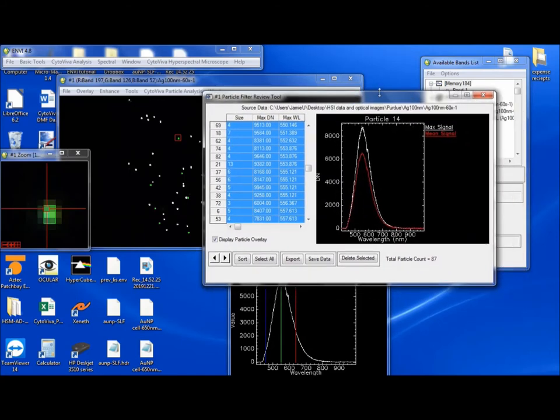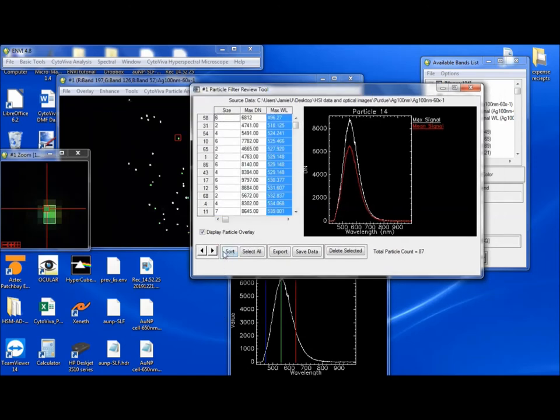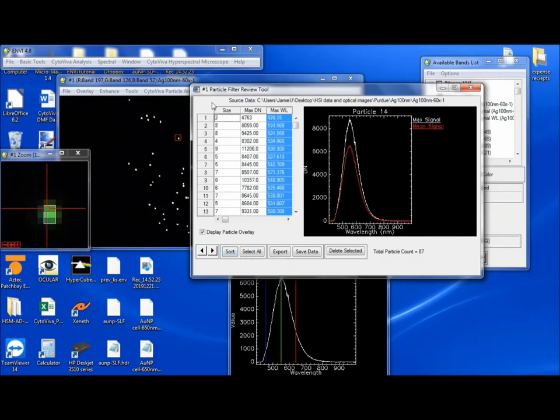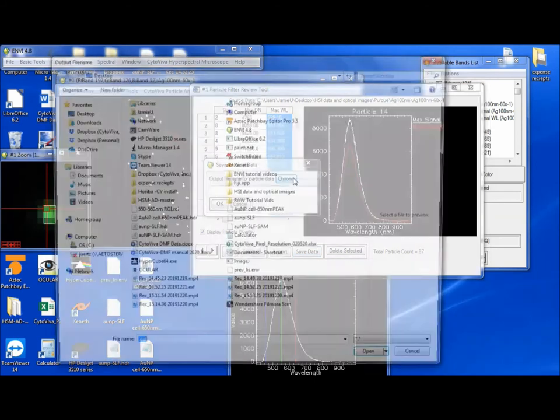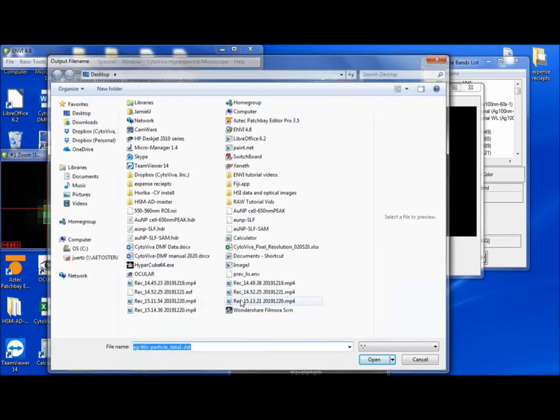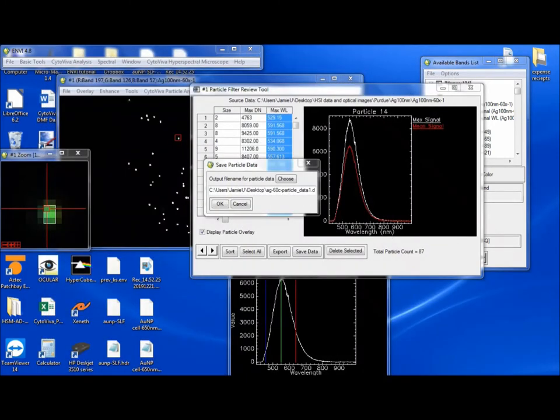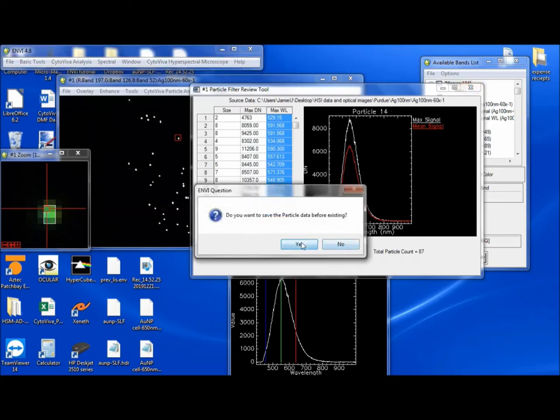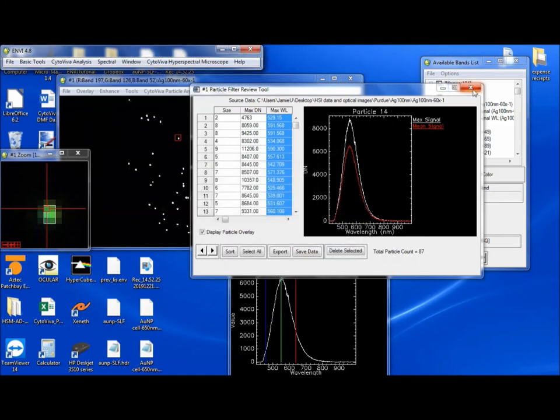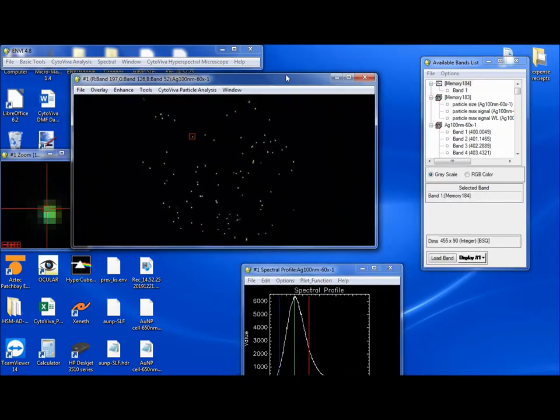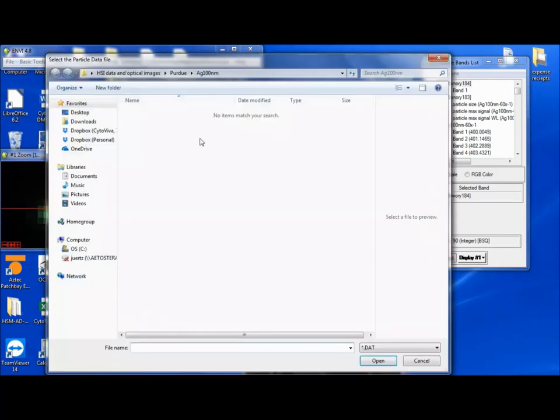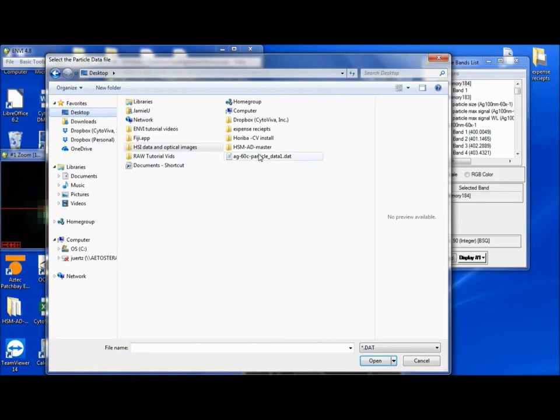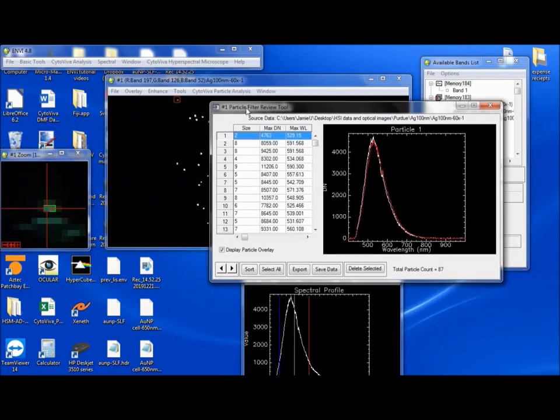But now if you're happy with the way that this is all displayed, we can go back to sort. If you go to revert, it'll go back to just the usual numbering scheme. So if you wanted to save this just in this form, you can say save data. And instead of to ASCII, you can say particle data. So now we can say AG60X particle data 1. I already saved it, so I can just say no. So now if we go to particle analysis, we go to restore results, and we go to the desktop, we have this AG60X. And here it is. So it's back in its original form.